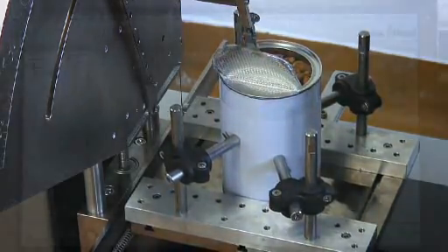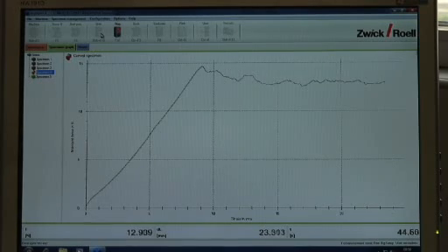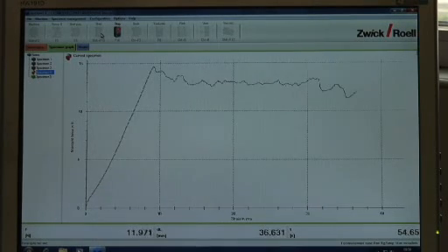Peel testing is used to measure the strength of a seal and the uniformity of a seal, particularly in tray and lidding applications.